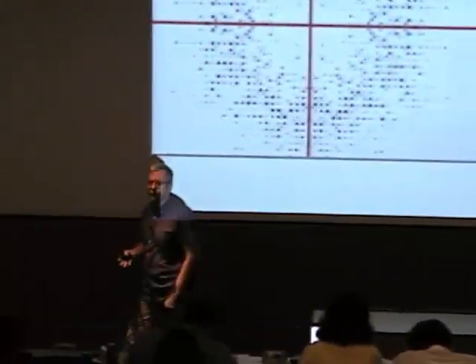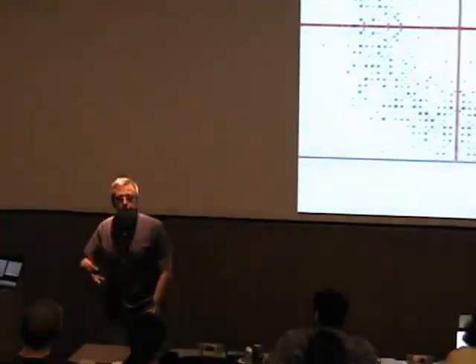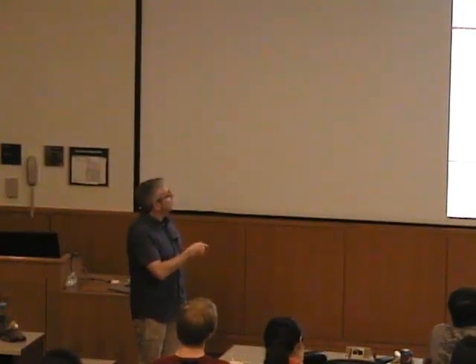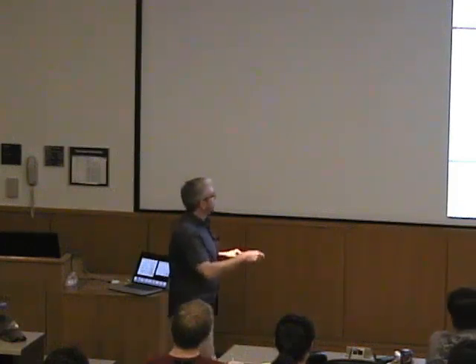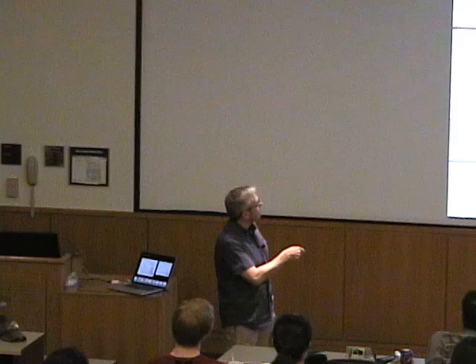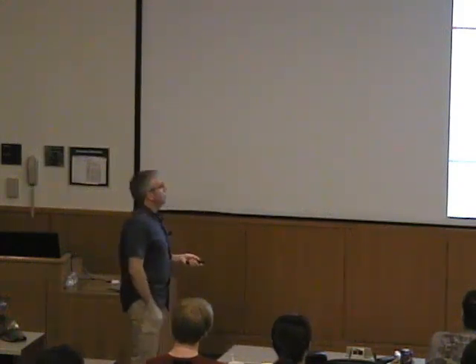Okay, and in the end, of course, we can look at this table and plot it, for example, like this. So this would be a plot of all these reflections, and we would call this the reciprocal lattice. We don't see this on one single diffraction image, but if we get everything collected and all the indices HKL assigned, then this is what we can reconstruct from it. And the Miller indices are just counting in 3 dimensions. HKL sticks out, just counting reflections, one after another. It's just basically the numbers.